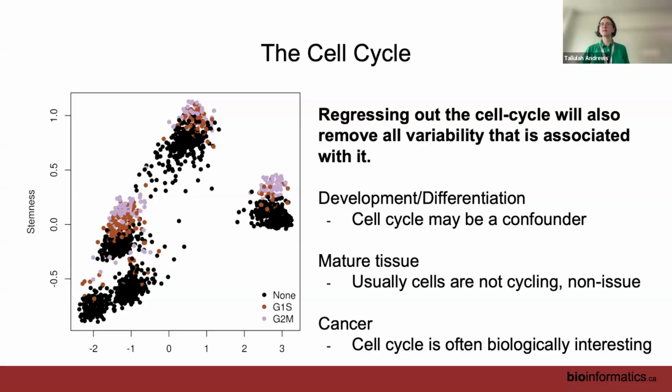Another question, what analysis can be applied if I'm interested in knowing the effects of cell cycle and apoptosis? If you're interested in knowing the effects, then you don't want to regress them out. You want to use them in your differential expression test, which I'll talk about tomorrow.